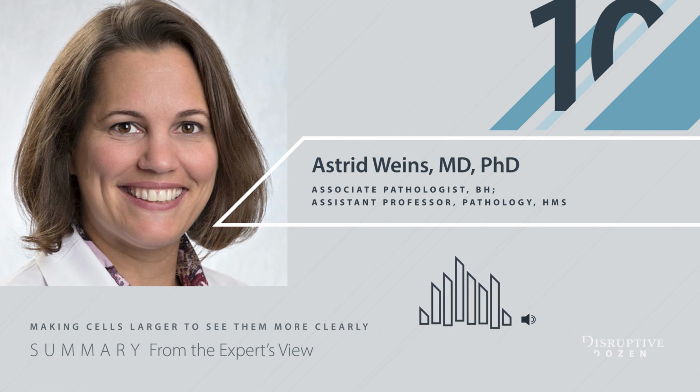Expansion microscopy is a great tool for researchers and diagnostic pathologists alike that can help us to not only visualize, but also to annotate with molecular markers nanometric structures, such as, for example, the kidney filtration barrier or small organelles within cells. We can visualize disease processes that then enables us to make better and more precise diagnoses. Expansion microscopy has the potential to revolutionize diagnostic pathology and disease research.